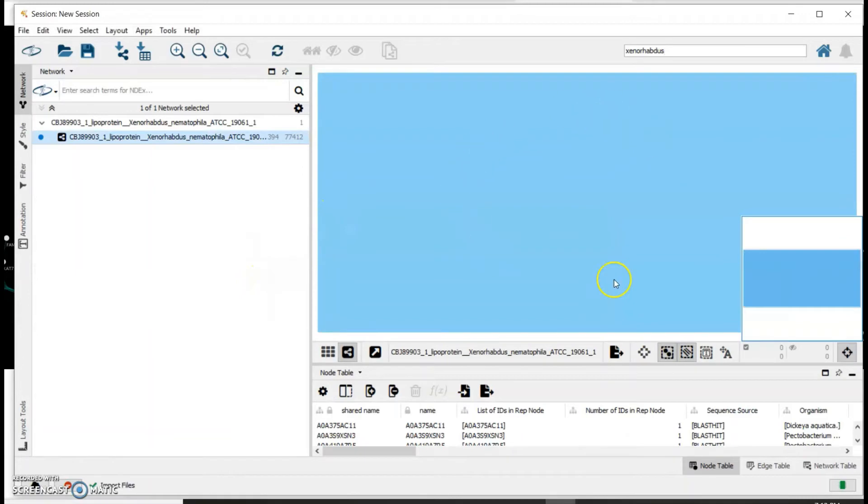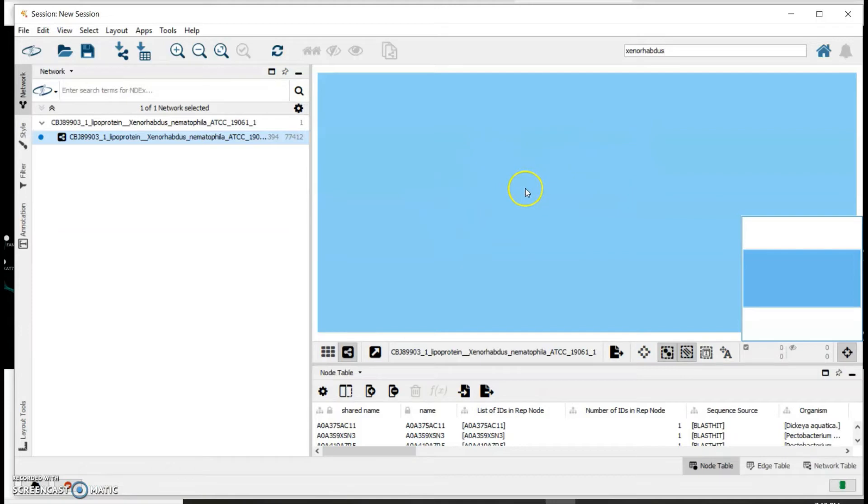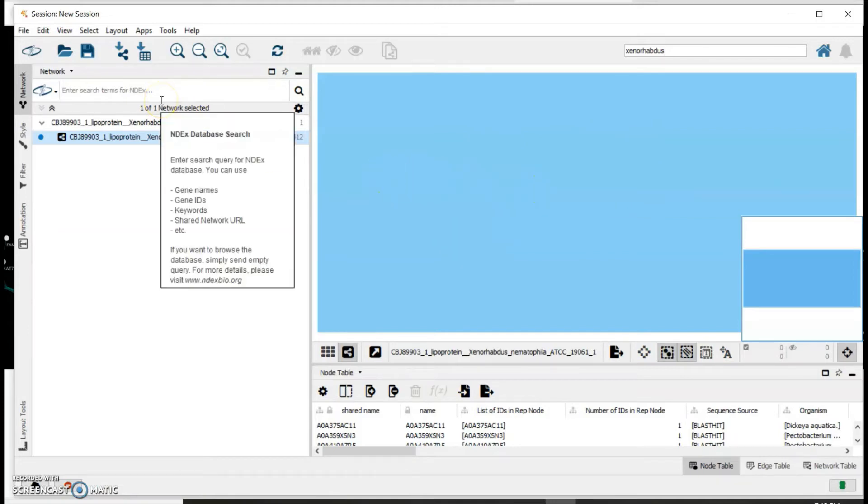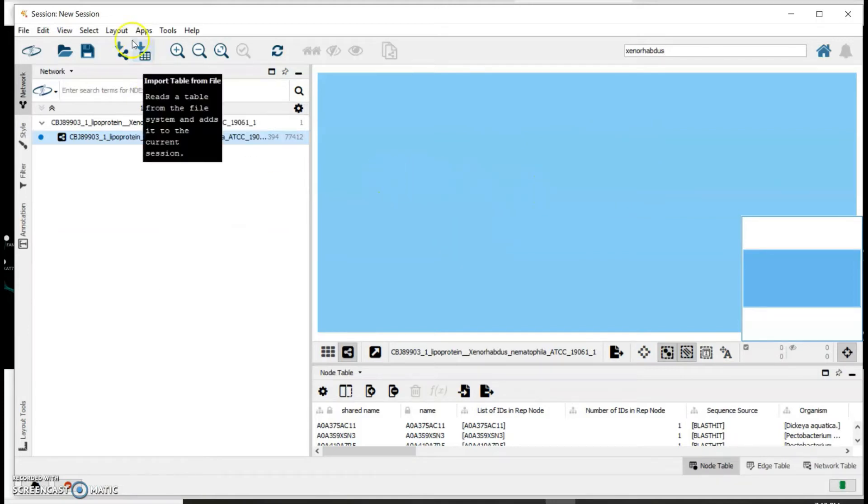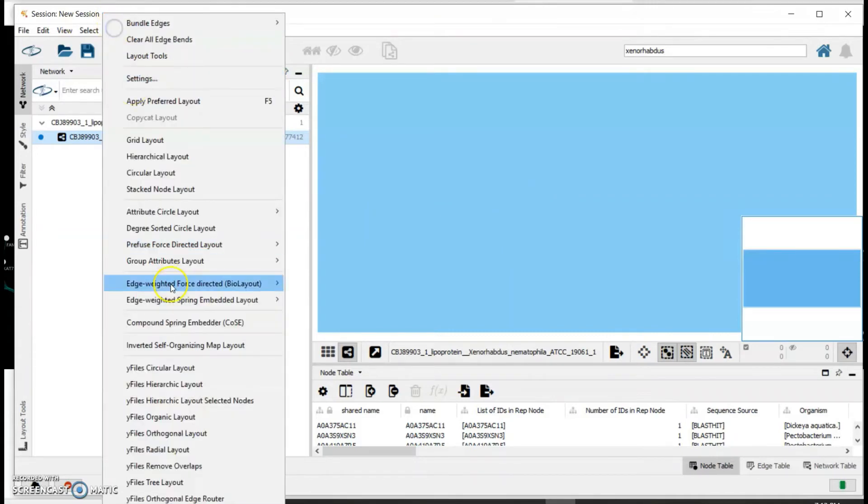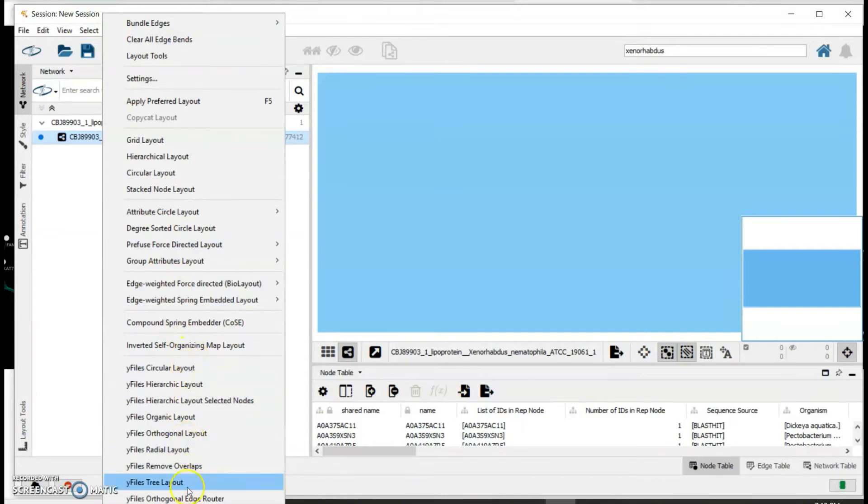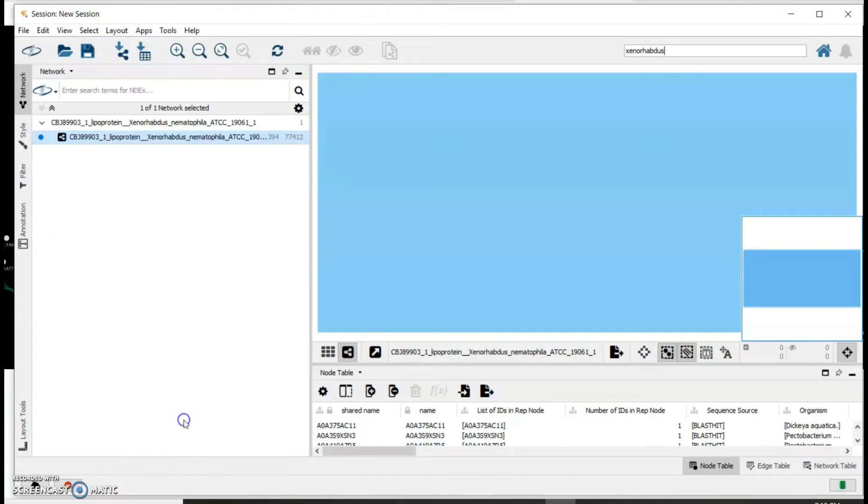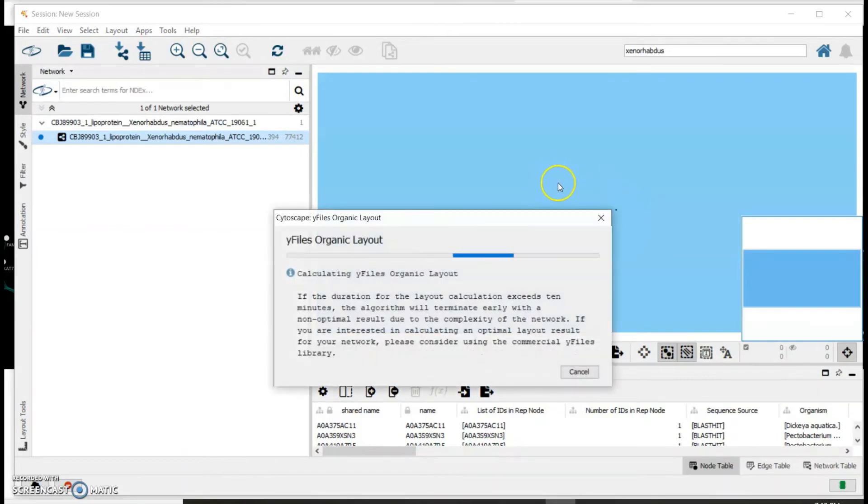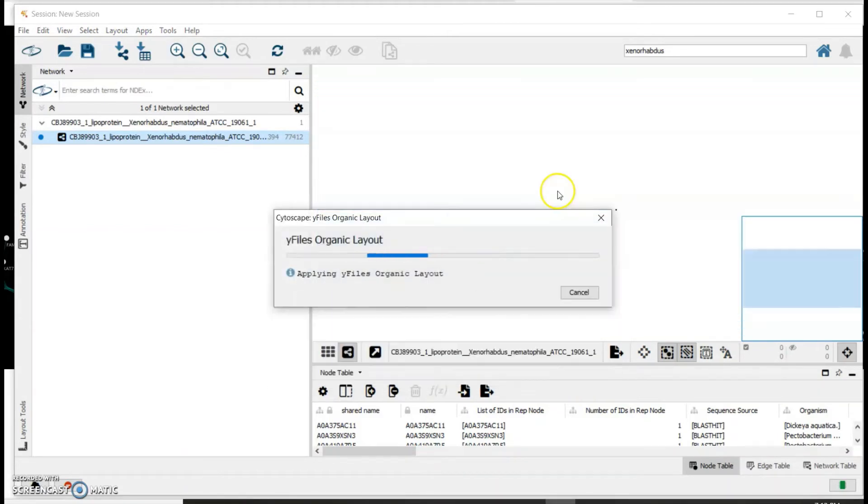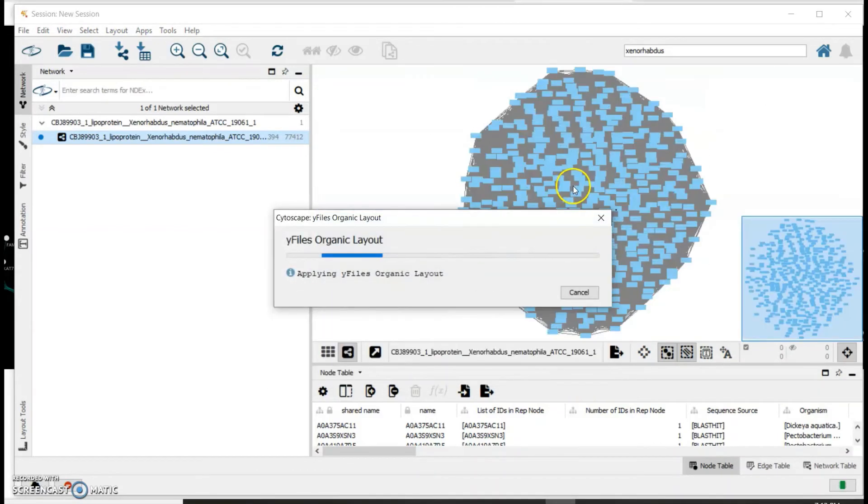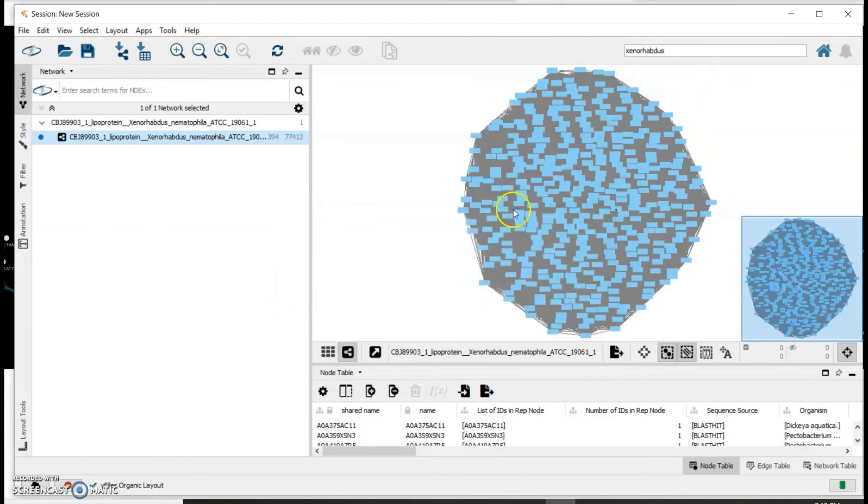Your network will appear on this window. As you can see right now it's just a black box, but what you can do is click on Layout - you can pick whichever layout you want but I usually prefer this yFiles organic layout. This helps create a network that we can use for some analysis.